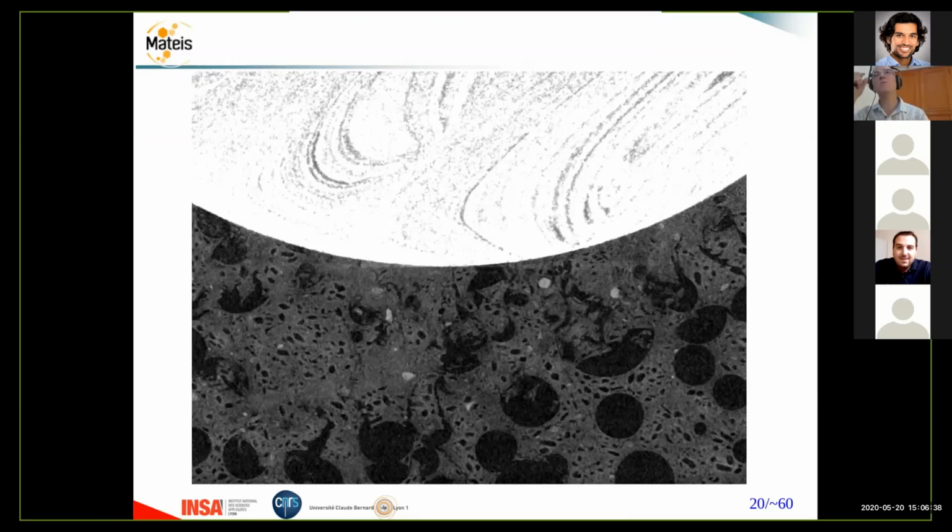And this is the reason why we have chosen such a moderate penetration depth, only 100 microns that you see here. Because if you go too fast, too quick, then you lose completely the software that makes the correlation, and it's difficult.